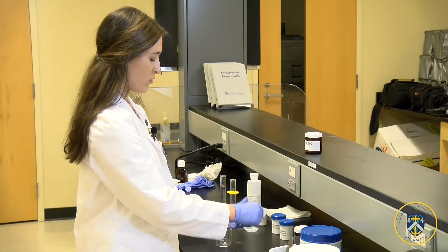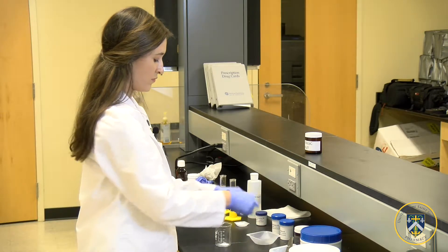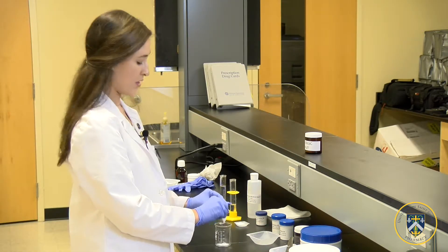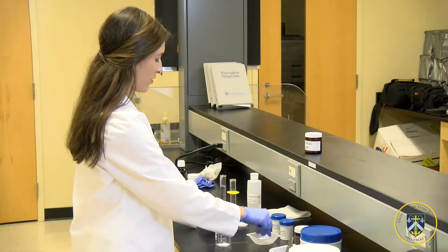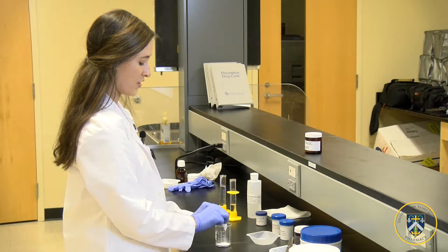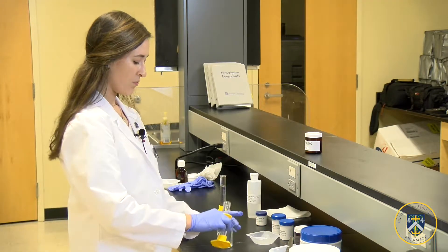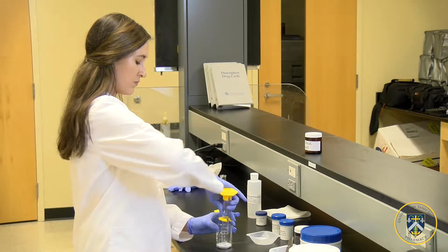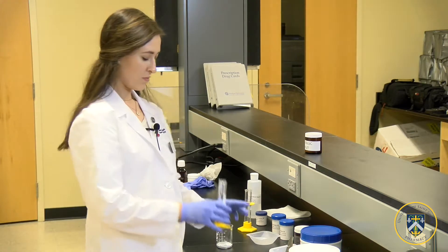First we'll add our preservatives in their necessary measured amounts — methyl and propylparaben — then our sodium lauryl sulfate, our surfactant, our polyethylene glycol, and our water, or diluent.